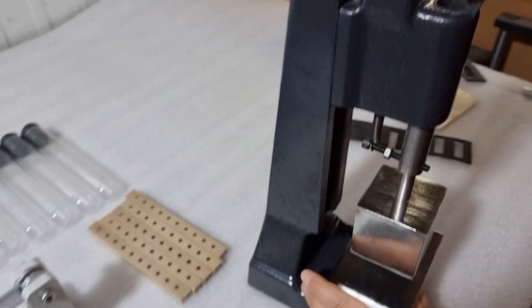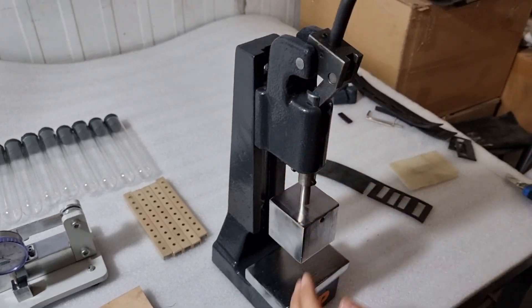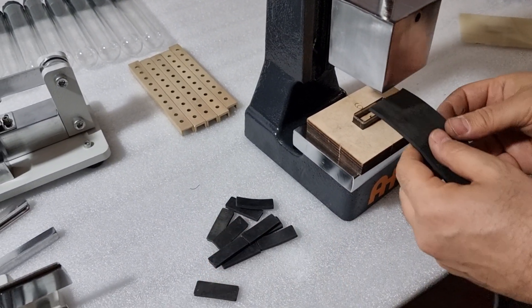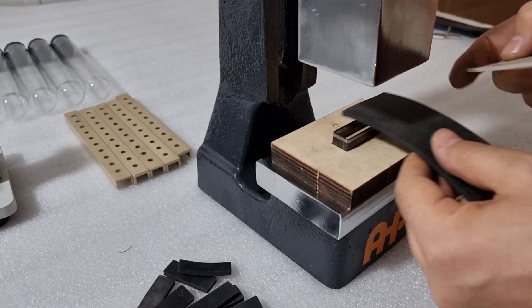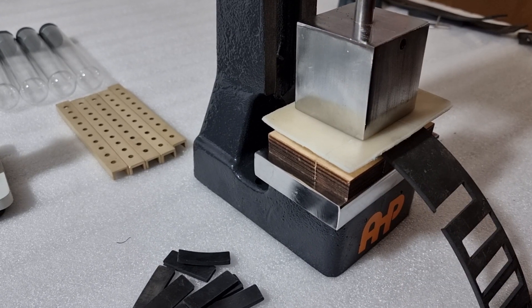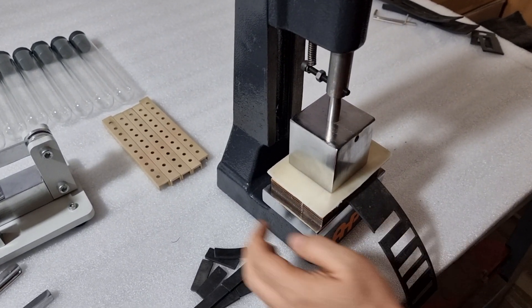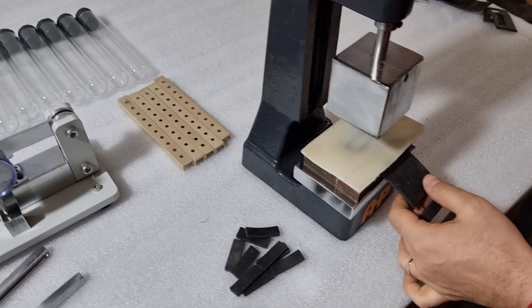The height of the press tool head needs to be adjusted to cut the sample piece at the correct point of the handle. First, put the cutter, then the sample piece, then the protecting sheet to protect the edges of the cutter. It should cut the sample piece at the point of the lever arm. You will cut the sample piece correctly if you adjust the height to the correct position.